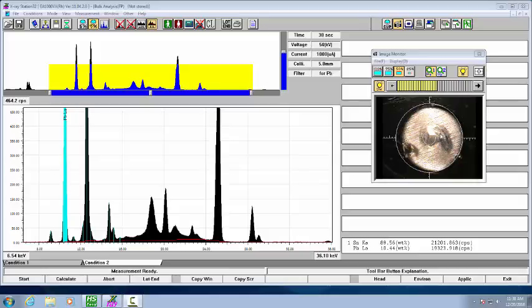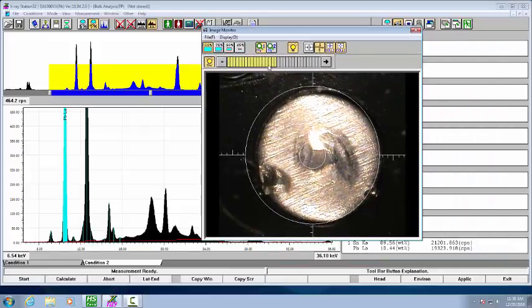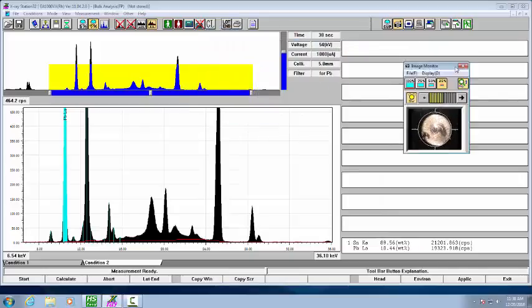It's 90% tin, 10% lead. You'll see it in the viewing window here. I'll minimize this for now to push it off to the side.